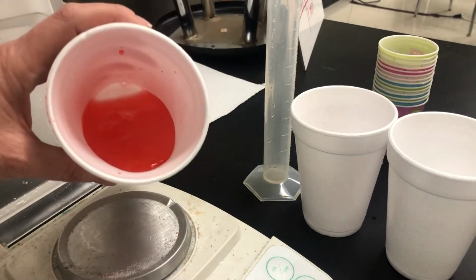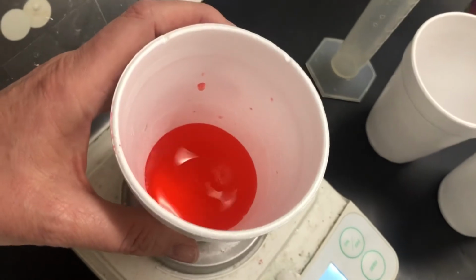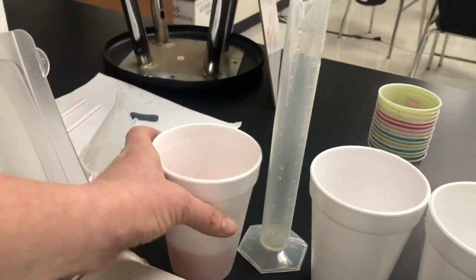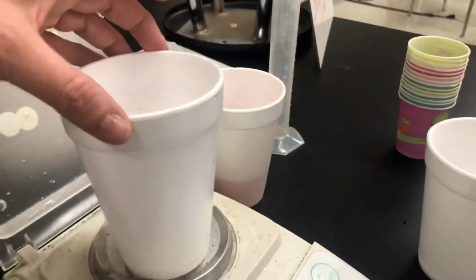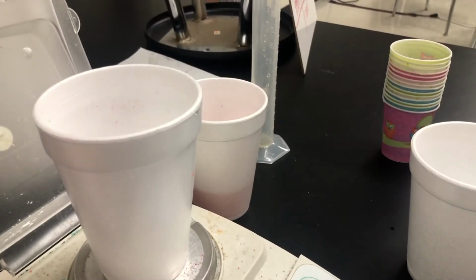I don't know if you can see it, but there is your cup number 1 Kool-Aid. All right, now I'm going to do it with cup number 2 and cup number 3. Cup number 2 goes on to the balance. We zero it out. This one has quite a bit more than the first cup.